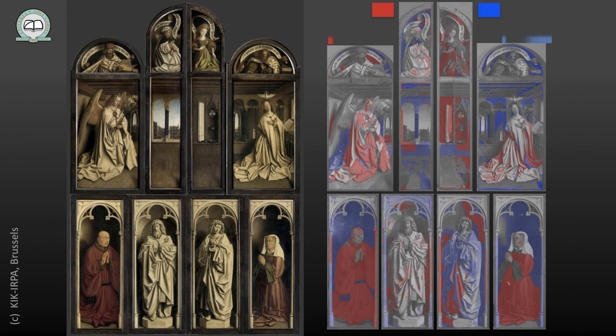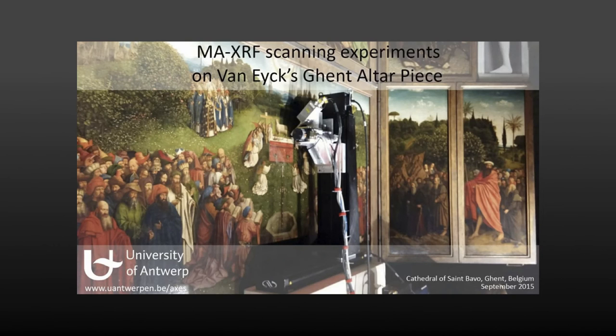What's happened now is that this already fairly long restoration procedure has been extended for 2 years to remove all this non-original paint, to make visible again the original layers by Van Eyck. So this was a nice result because we could objectively make the difference between what was original and not. Yeah, this is another video. I think I will end with that. It gives you an idea what our scanner does.